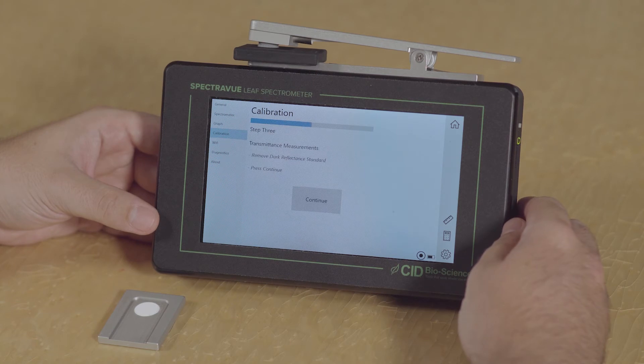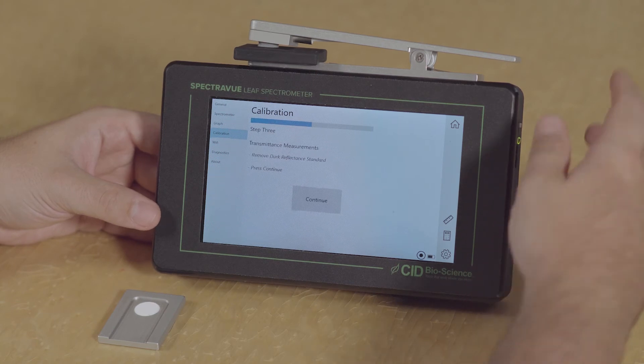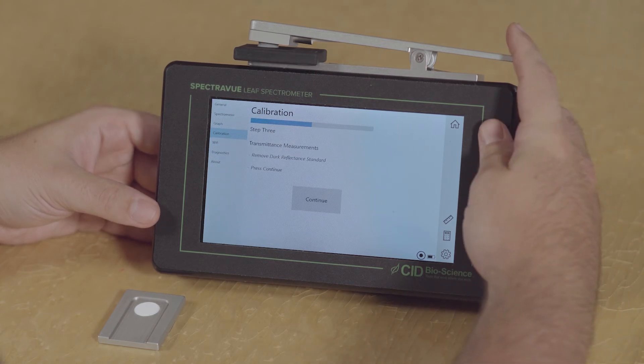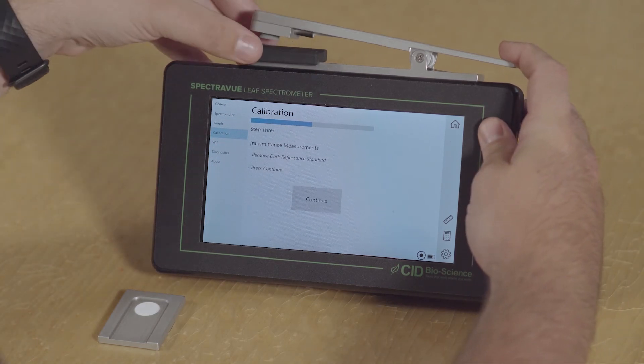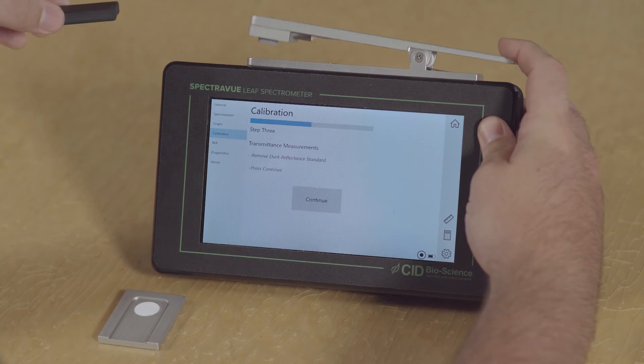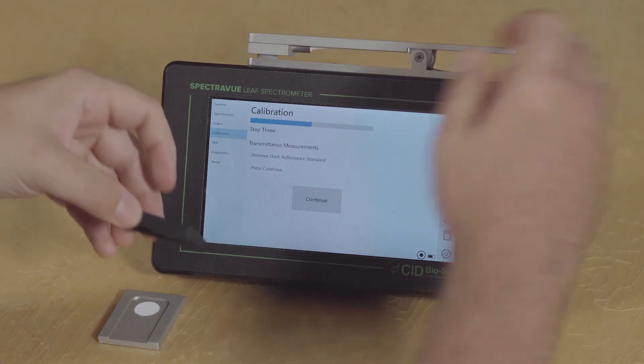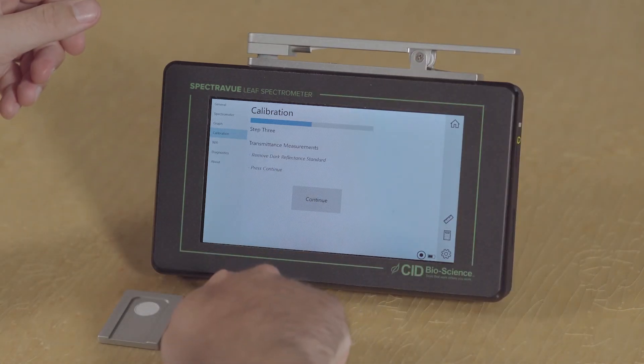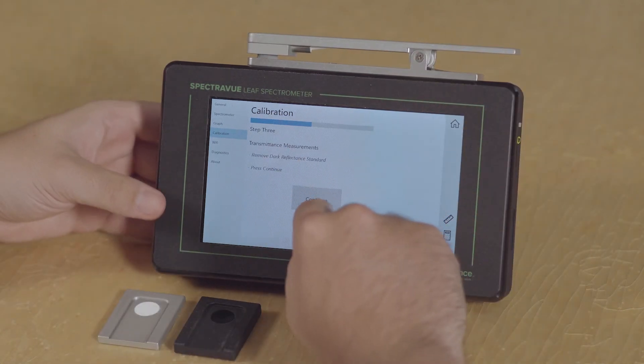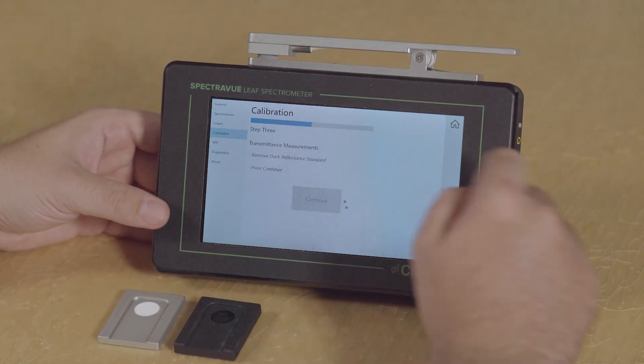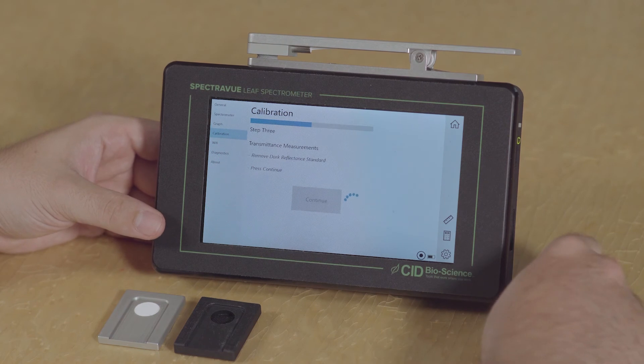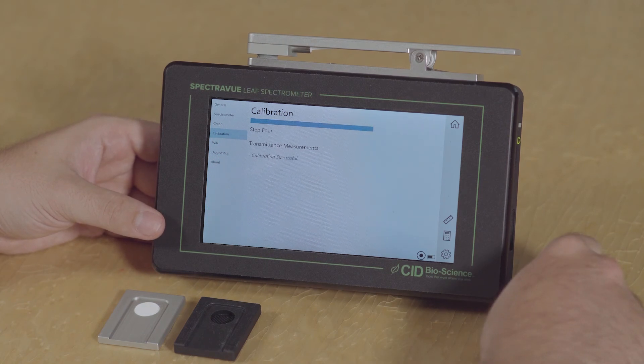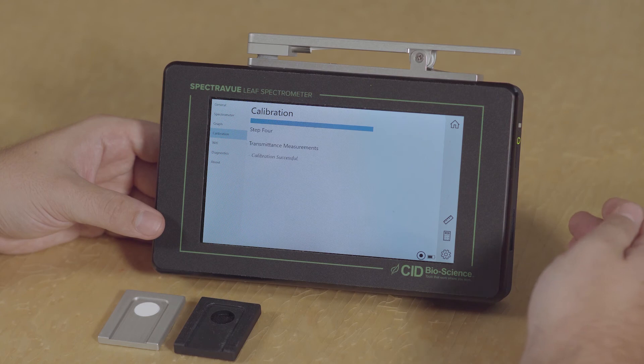And then step three is going to be to remove the dark reflectance standard, leave nothing in the instrument, and simply click continue. And now the instrument notifies us that calibration has been successful.